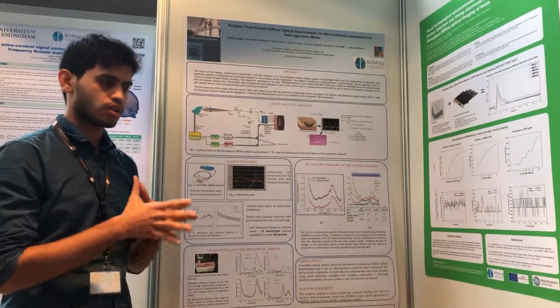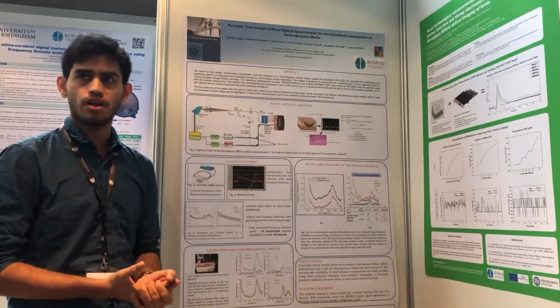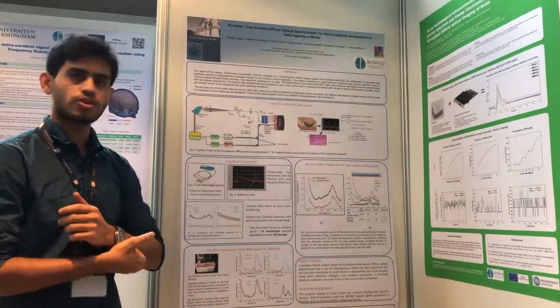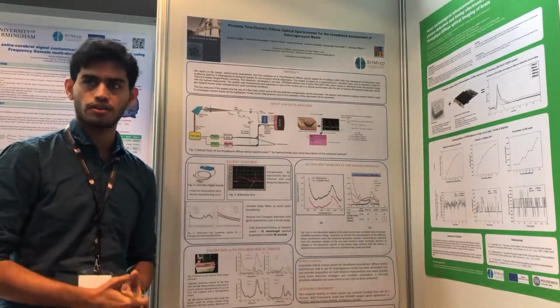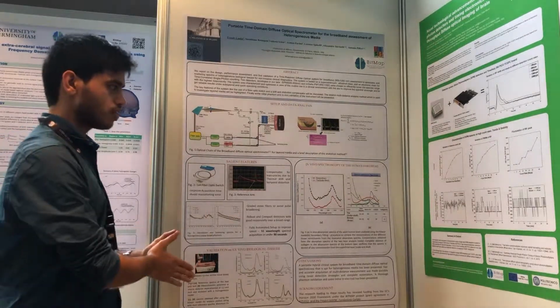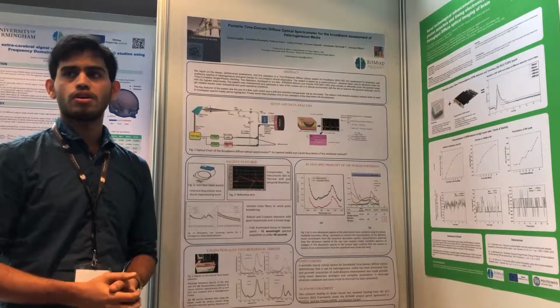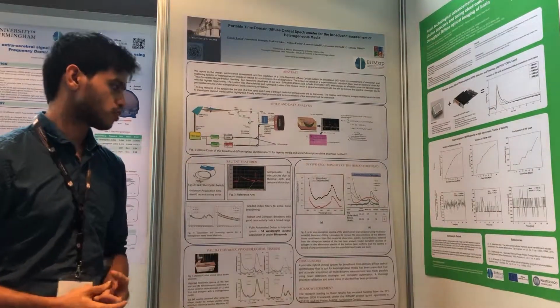And we know that collagen is the important constituent which makes up the skull. So here we can be quite sure that in the retrieved underlying layer's absorption you see literally no collagen content, which means that there is no contamination from the skull in this particular absorption spectra.